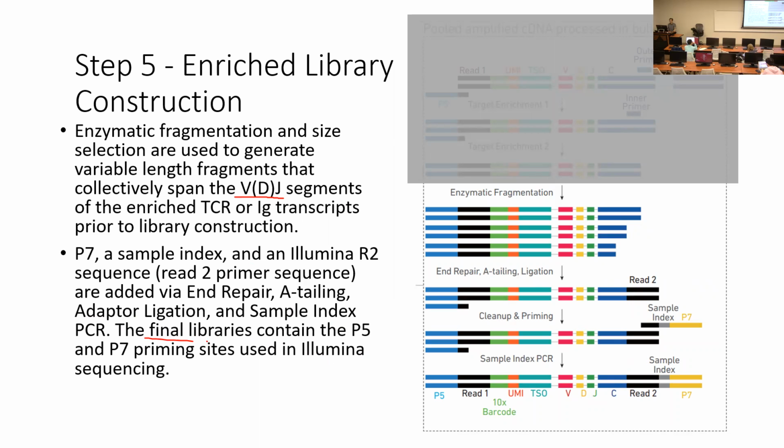So the final library contains the Illumina sequence standard primers. So next is to send this prepared library to the Illumina sequencer to get the massive, large scale sequence, so you can have enough reads to do the analysis.